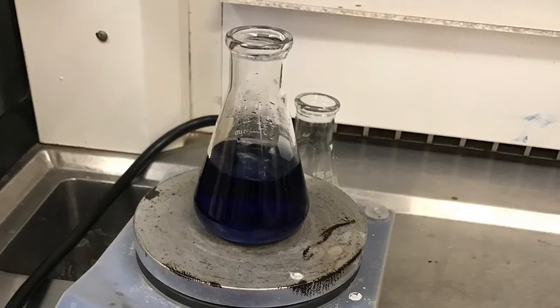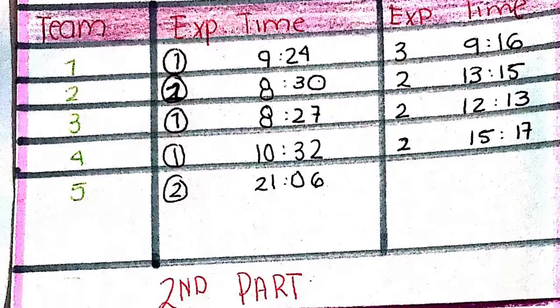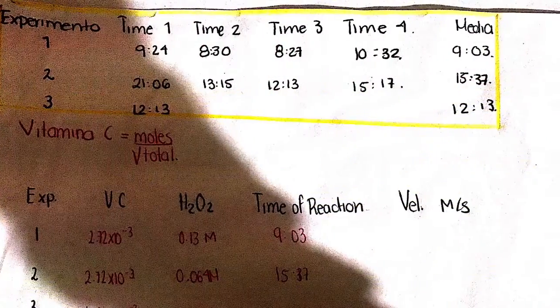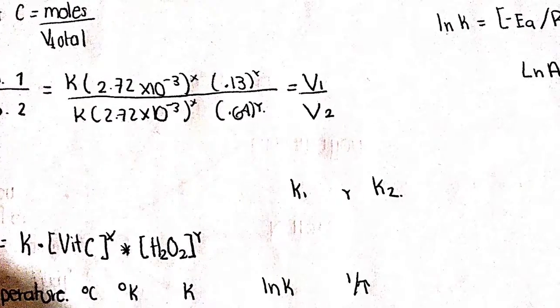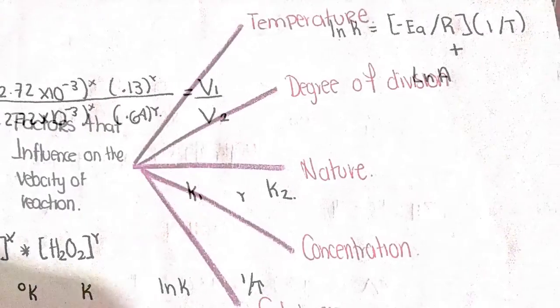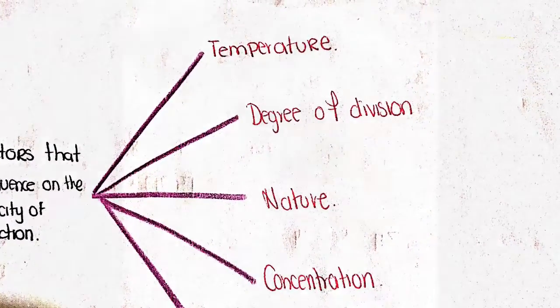But also I note that if you keep the same concentration of the reactants and the same temperature, the variation on each experiment is very small. From the experiment part 1 and part 2, we can conclude that the temperature has to do more with the color and with the velocity of the reaction. If it is cold, the temperature, the slower is the reaction. It was very interesting that the change of color with the third experiment was faster.